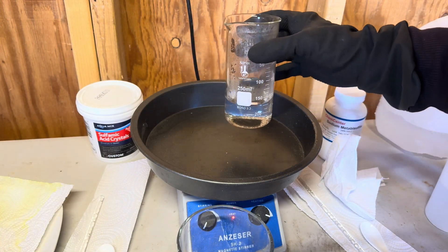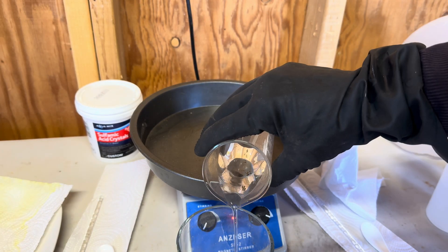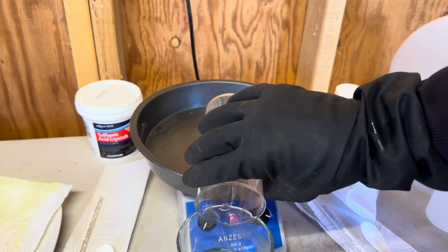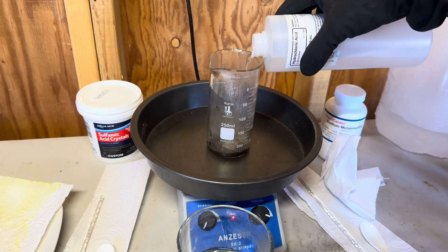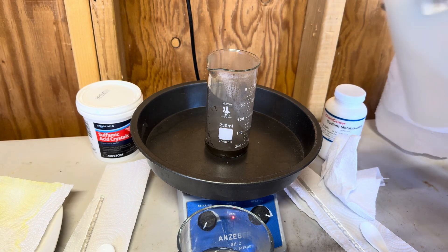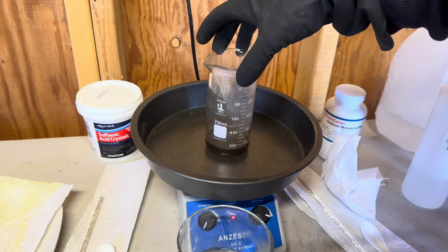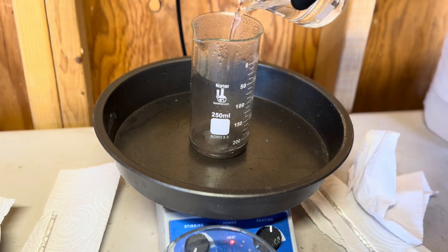We are decanting our rinse — I forgot to start the camera when I poured in the distilled water to start this rinse. Now we will do our hydrochloric rinse to clean up our gold. Now we will perform our final rinse with some distilled water.